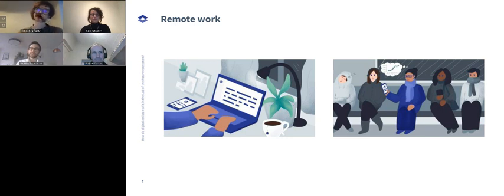And for me, there's one big question, and I think we touched a bit on that, is predictive maintenance, and also that augmented reality, meaning you get trained by an instrument provider, well, not even trained, but you're guided. You have your smart glasses on and someone in your ear telling you, okay, now loosen that screw, take that out, put that in, and that's all fine.